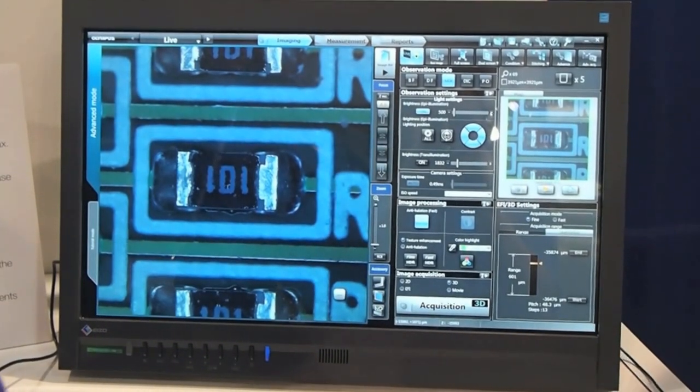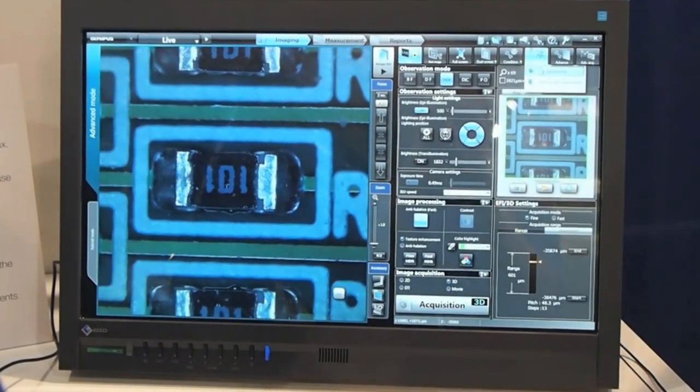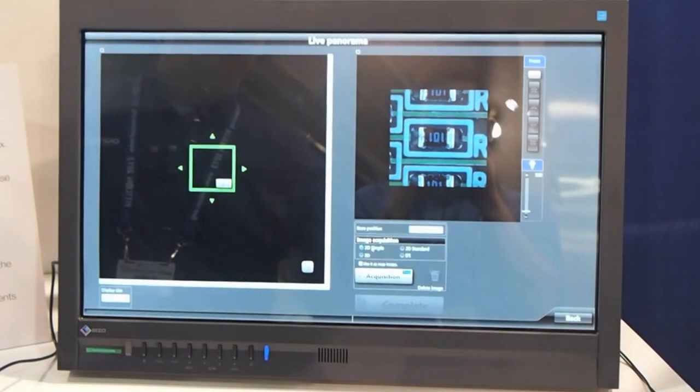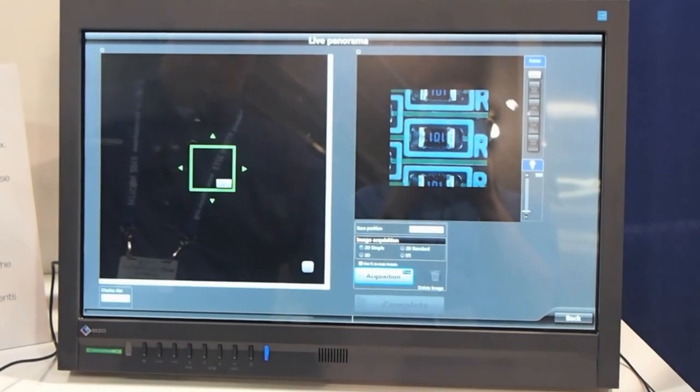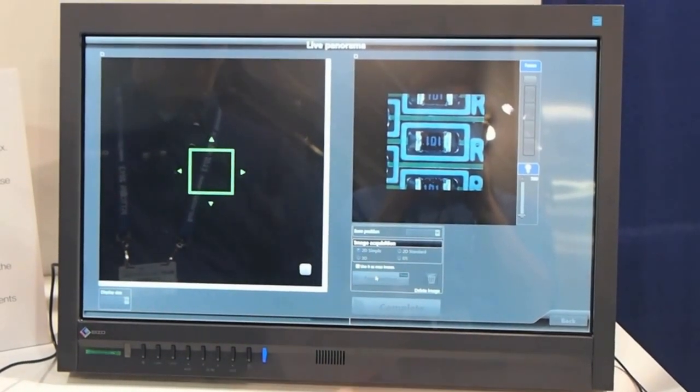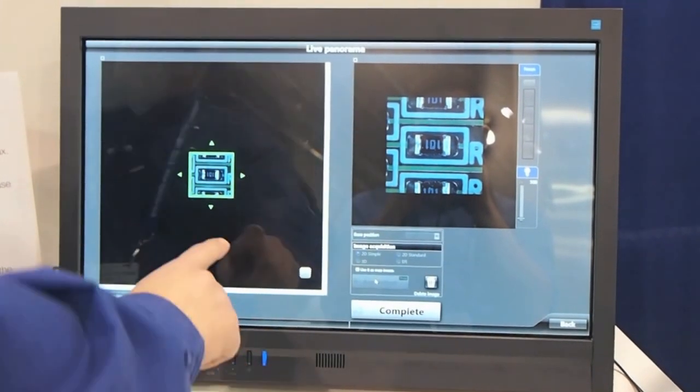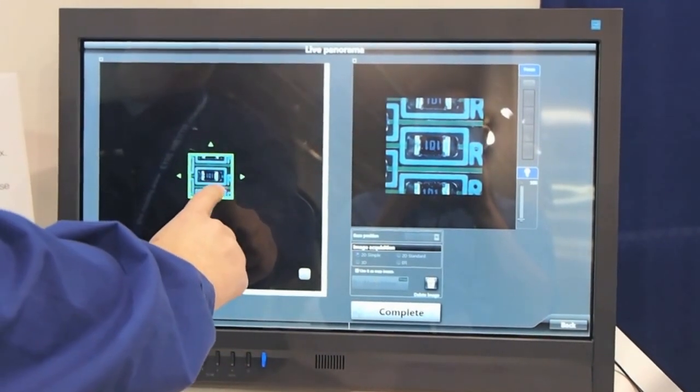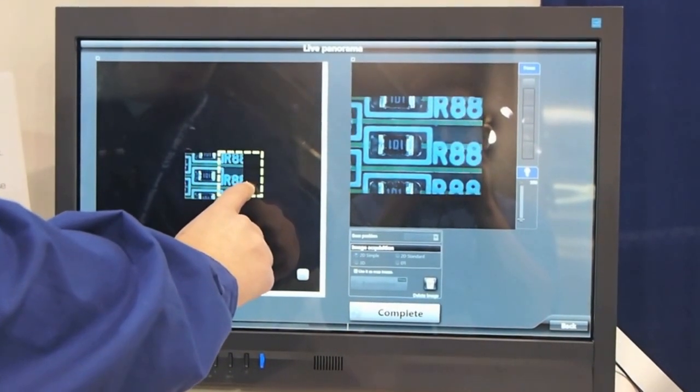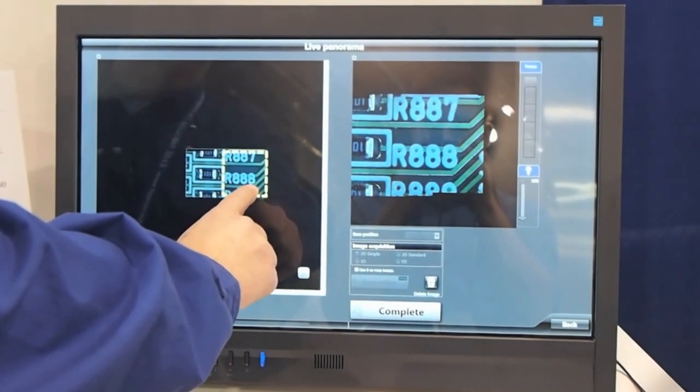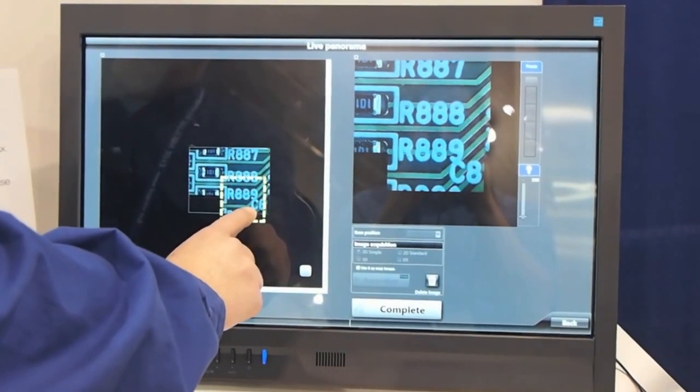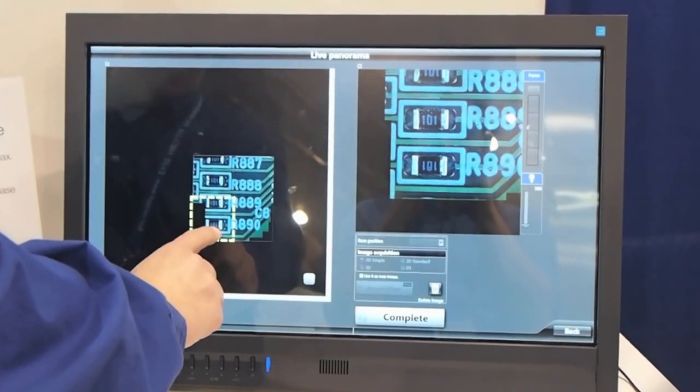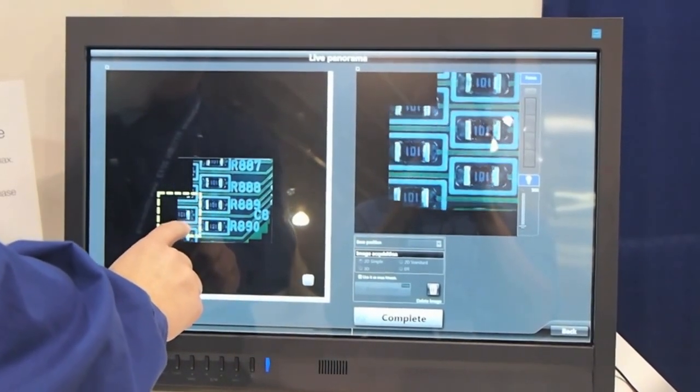We start the stitching mode for a quick panoramic view. Utilizing the touchscreen monitor, I can move the motorized stage by simply moving my finger. The scans happen in real time and the image is being stitched together.